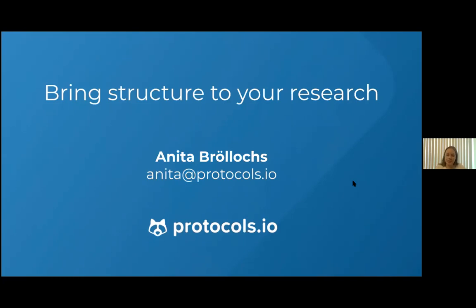But also it does depend on what the workspace settings are. So if a new workspace is created, the admin always has an option to choose between different settings. And there's actually an option that prevents people from publishing protocols that are in a workspace. So if that's the setting for your group, then you won't be able to publish. But if that's not a setting, then you would be able to publish.